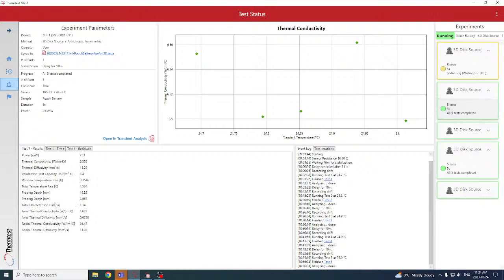You can see here we have our penetration depths. I'll review this in the analysis app. You can see the input of 2.4. Again, we measured that and we'll review that as well. So we get all this data here, and this screen really is the capture of the data as it's being generated.